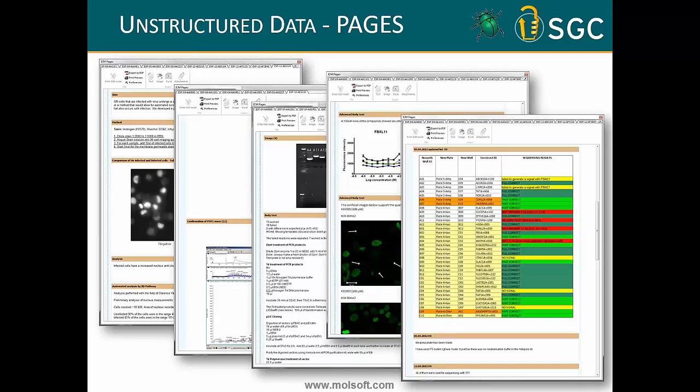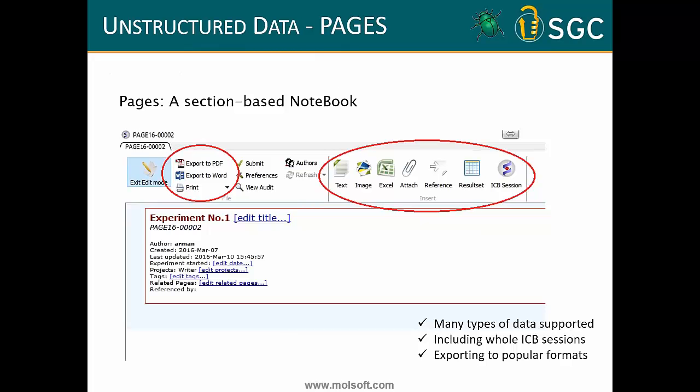If I flip to the next slide, you can get Excel sections in as well. That's a really important thing. I always forget to say that. So it will import Excel as well. This is what it looks like at the top of the user interface. Again, I'll show you this in a minute.